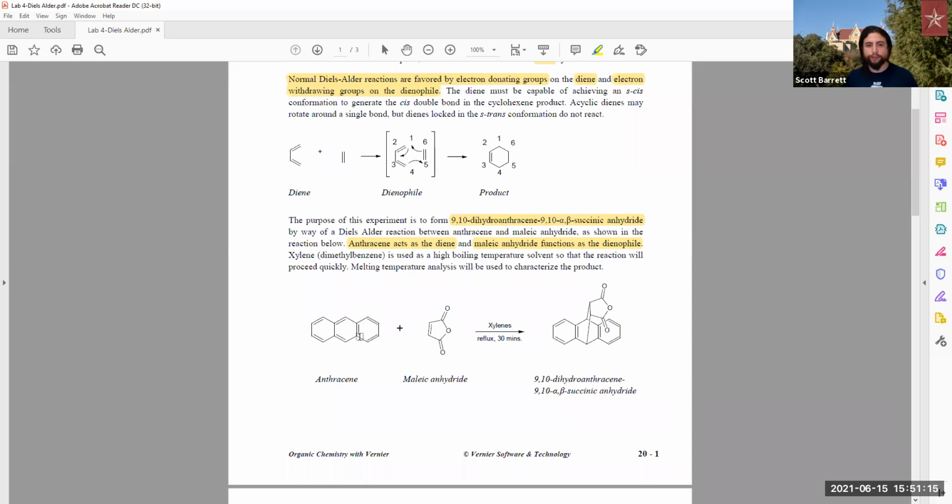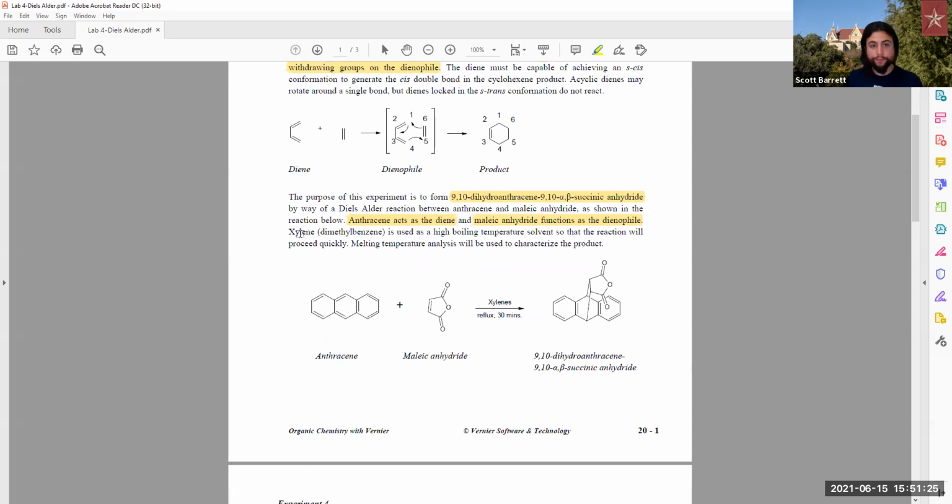It has a few electron donating groups from the benzene ring, allowing it to resonate back and forth. You probably remember from lower levels of chemistry, OChem 1, etc. And so we primarily use xylene here. Xylene is really good in lab for very high temperatures because with these sorts of reactions, you really have to overcome a very high barrier of energy.